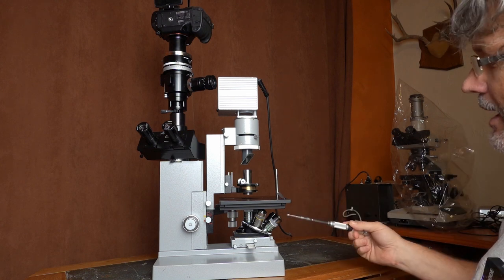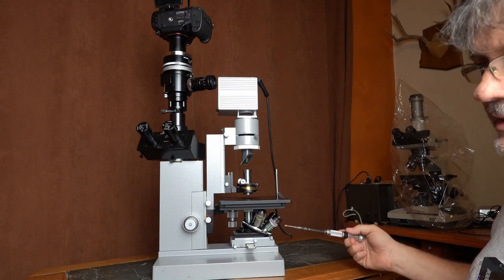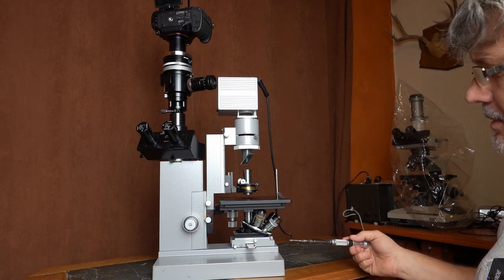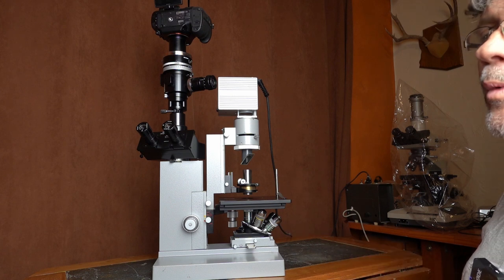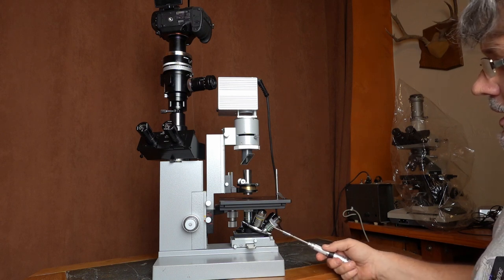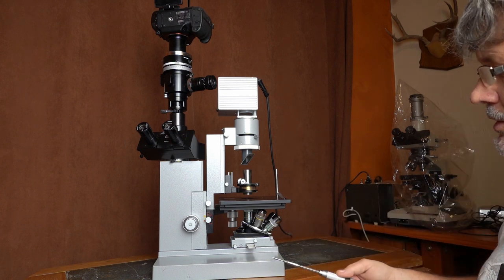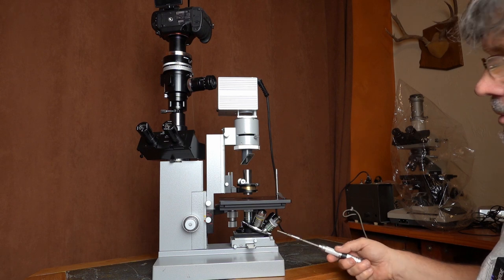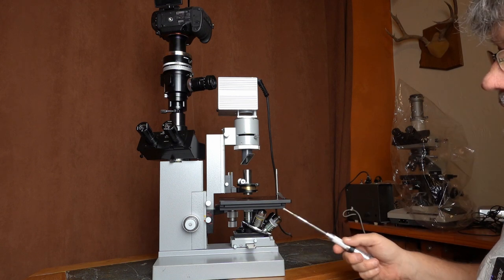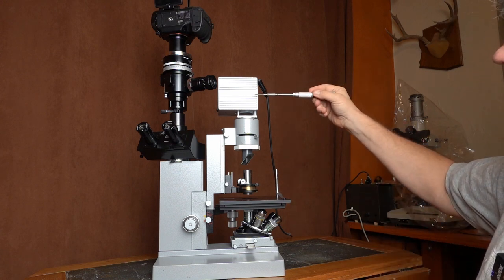On a microscope designed for 170mm tube length, you can also use 160mm tube length objectives. That means you have a wide array of objectives available for these old microscopes — you can put Nikon, Olympus, Leitz, or Zeiss objectives on here and they'll all work quite well. We'll talk a little more about the difference between 170 and 160 later when it comes to preserving the ultimate resolution.